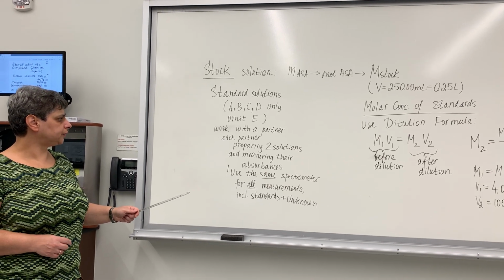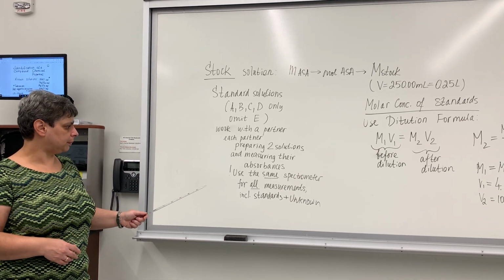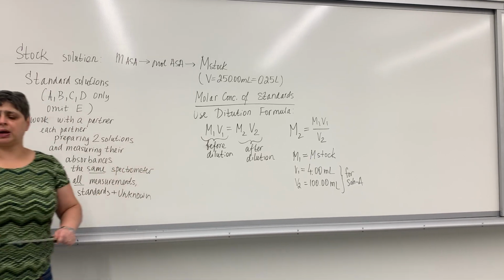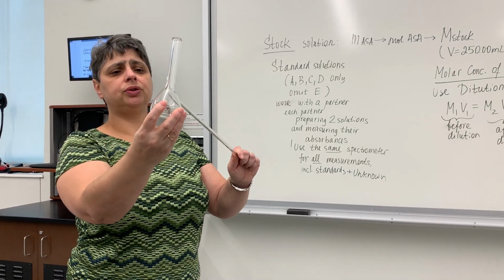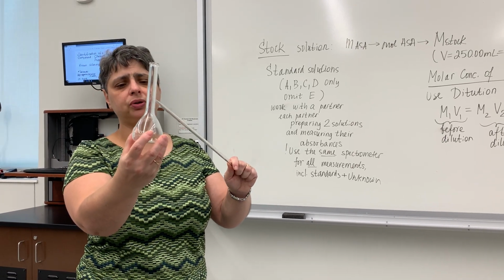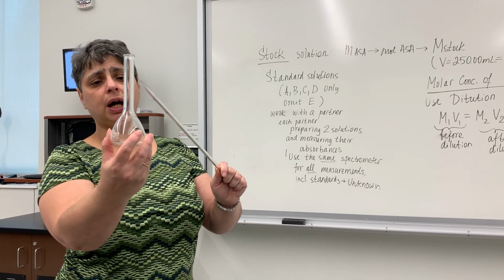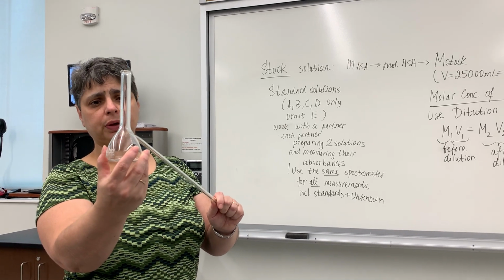So just to make sure everyone is on the same page, how do we find concentrations of standards? Just a reminder, after transferring, say, 4 milliliters of stock solution into here, you're then going to add the yellow solution from the brown container in the hood to the mark here. And as soon as you start adding that yellow solution to your stock, it should turn purple, because remember, the phenol group will react with the FeCl3, producing a purple complex.